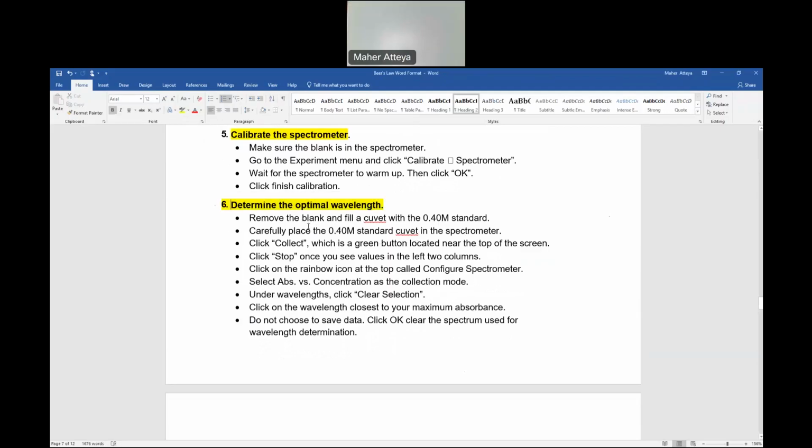So you do the same thing here. You take your cuvette. This time you will not use the beaker. The beakers will come later on, but this is before the beaker. You rinse with your solution from the flask, the 100 milliliter flask. Remember the 100 milliliter flask? You rinse it inside your waste beaker, and then fill it with the whole thing and measure which maximum wavelength it will give you.